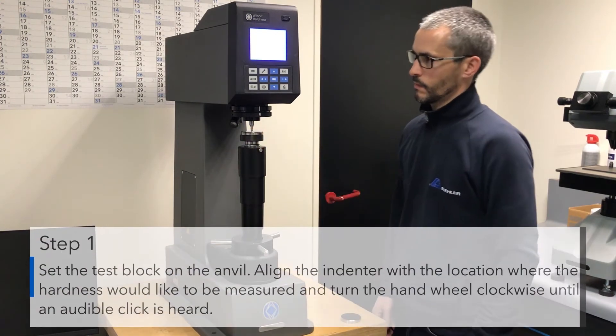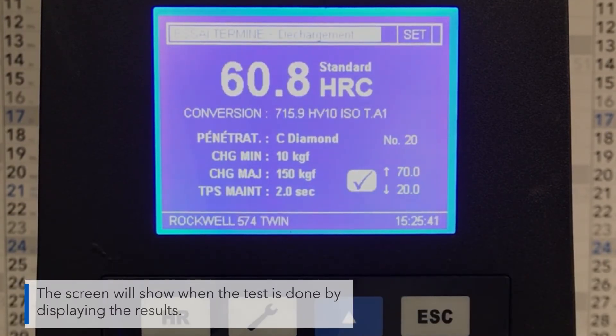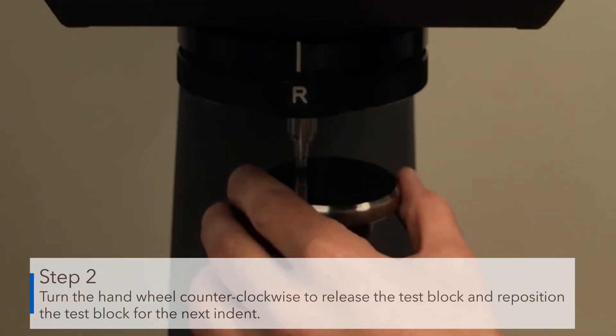Place the test block on the anvil. Align the indenter with the location where the hardness would like to be measured and turn the hand wheel clockwise until an audible click is heard. The screen will show when the test is done by displaying the results. Turn the hand wheel counterclockwise to release the test block and reposition it for the next indent.